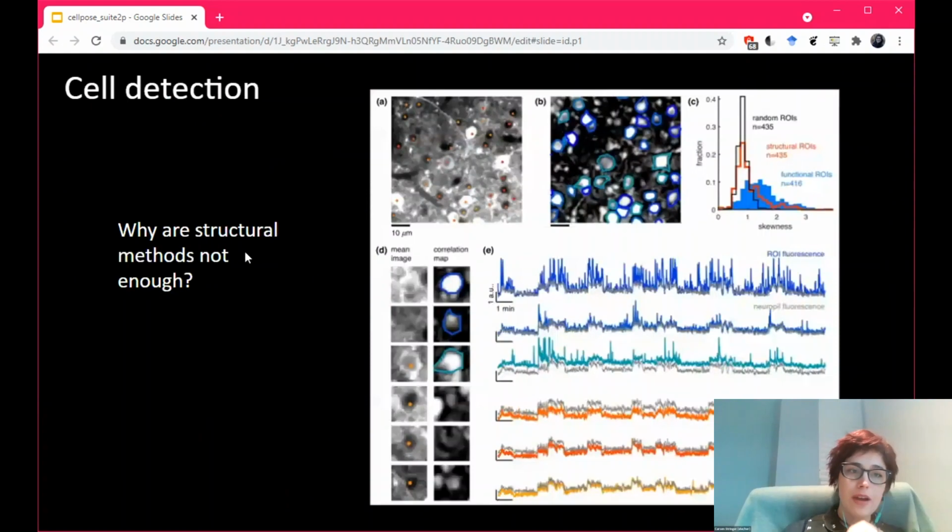Cool. All right. So I'm not going to go through all of Suite2p. I'm going to go through the cell detection in particular, and this question: we could use Cellpose on 2-photon calcium imaging data, but what we find is that there are many issues. Here's a zoom-in of calcium imaging data where we selected cell centers by eye, basically. This was before we had Cellpose.